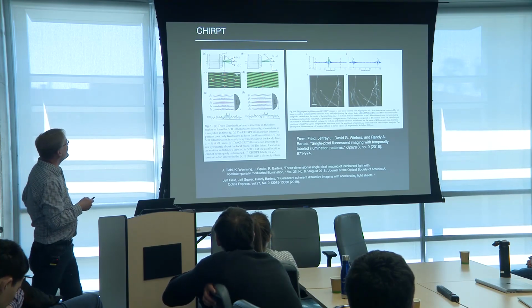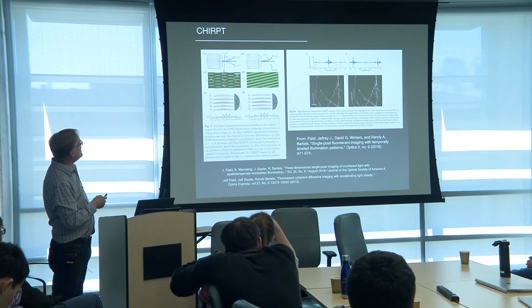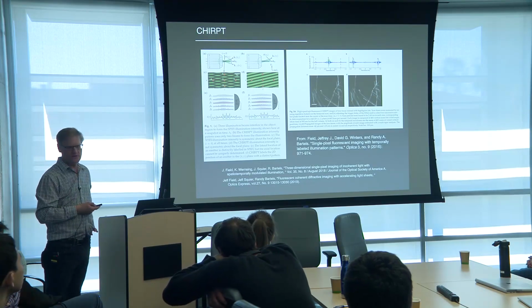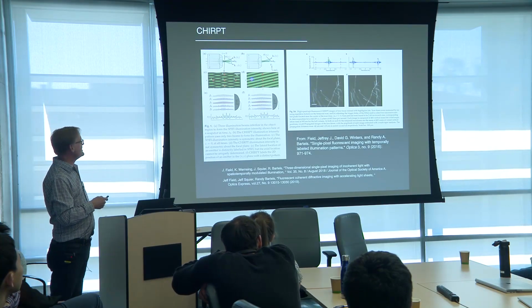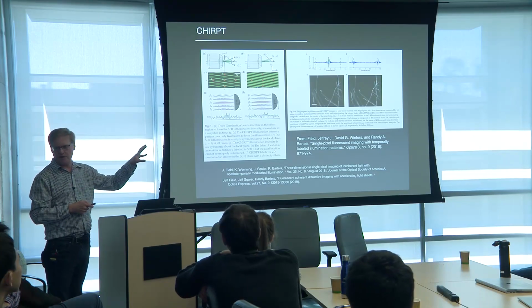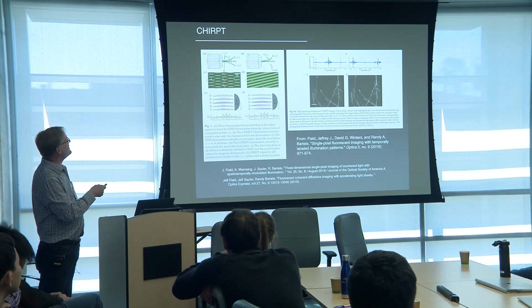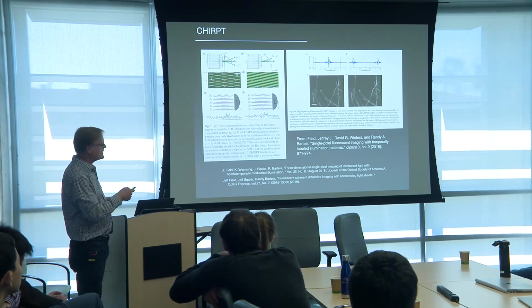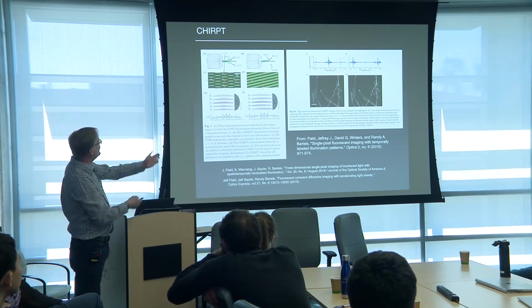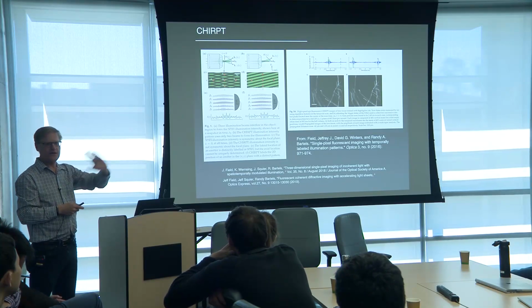What they have shown is that when they block one of the orders and only use 2 of the orders, that gives them a unique location of fluorescent particles in that XZ plane. Sorry, I'll try to flash it up. Along the X direction, you've already got the unique location.